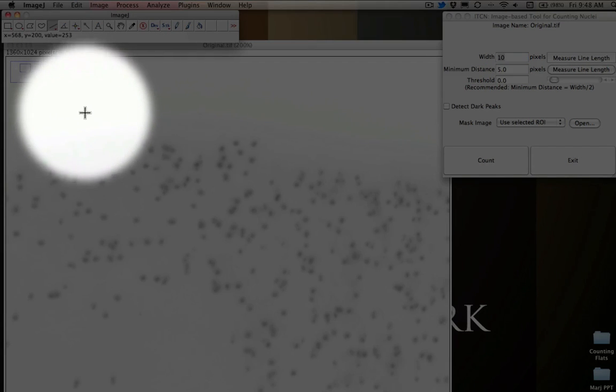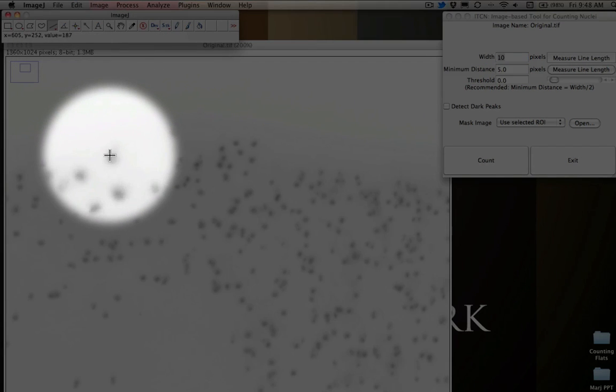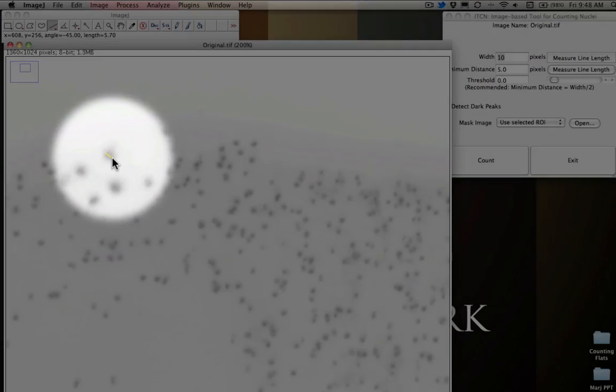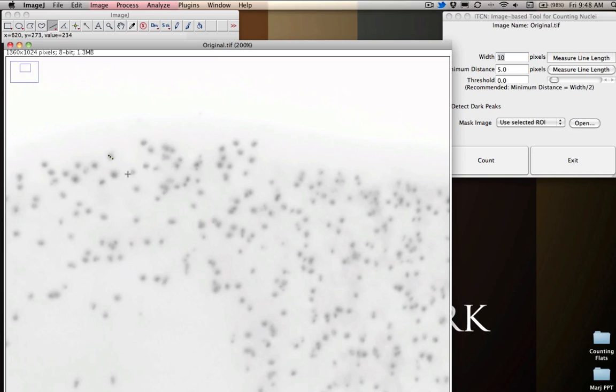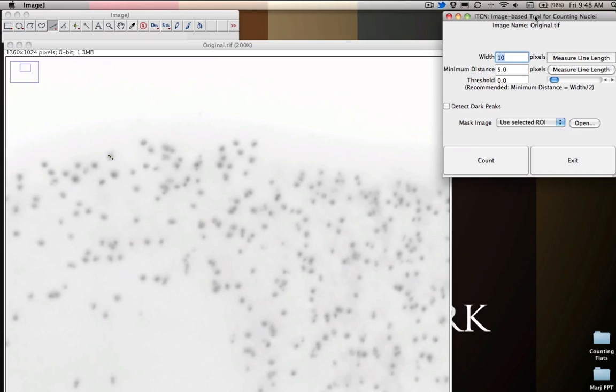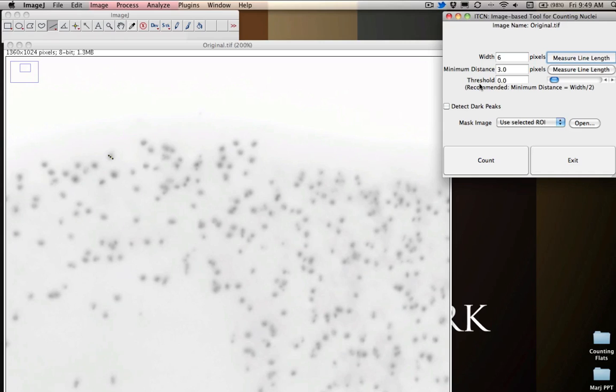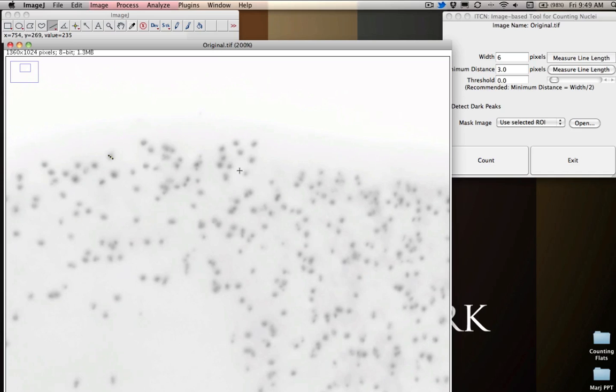So we could do this a couple different ways. We could grab one of our little measuring tools here, and we can draw a little line. And we should be able to get a rough idea of how big that is. So we draw a little line, we come back over, and we say measure line length. And it's going to come up with 6. And then we would do the same thing to find the minimum distance between two nuclei, because this is going to help it figure out how closely packed these things are together and how closely it should analyze this particular image.